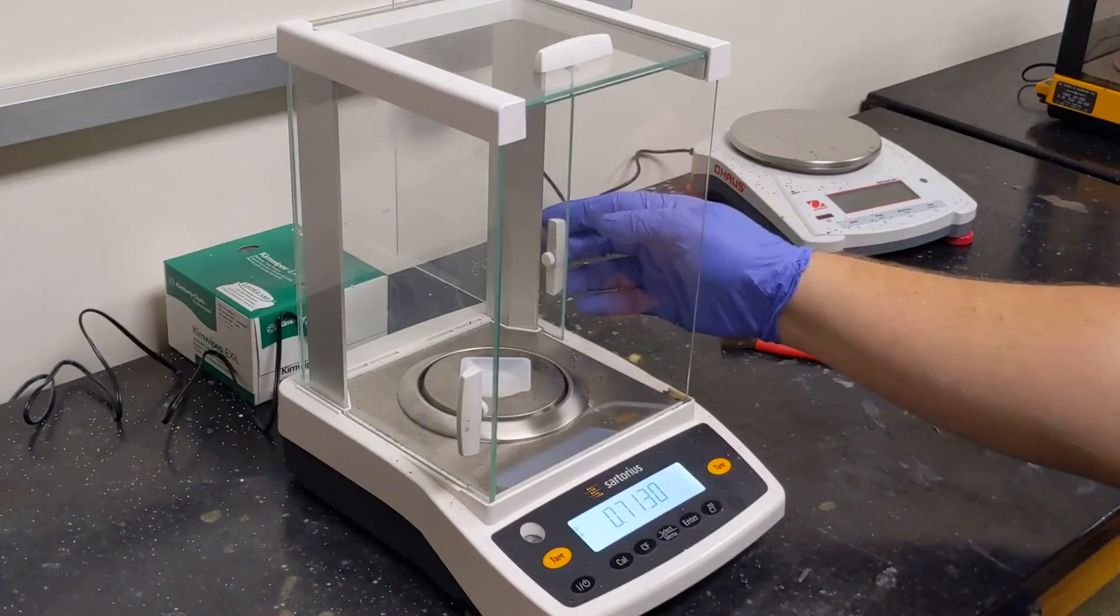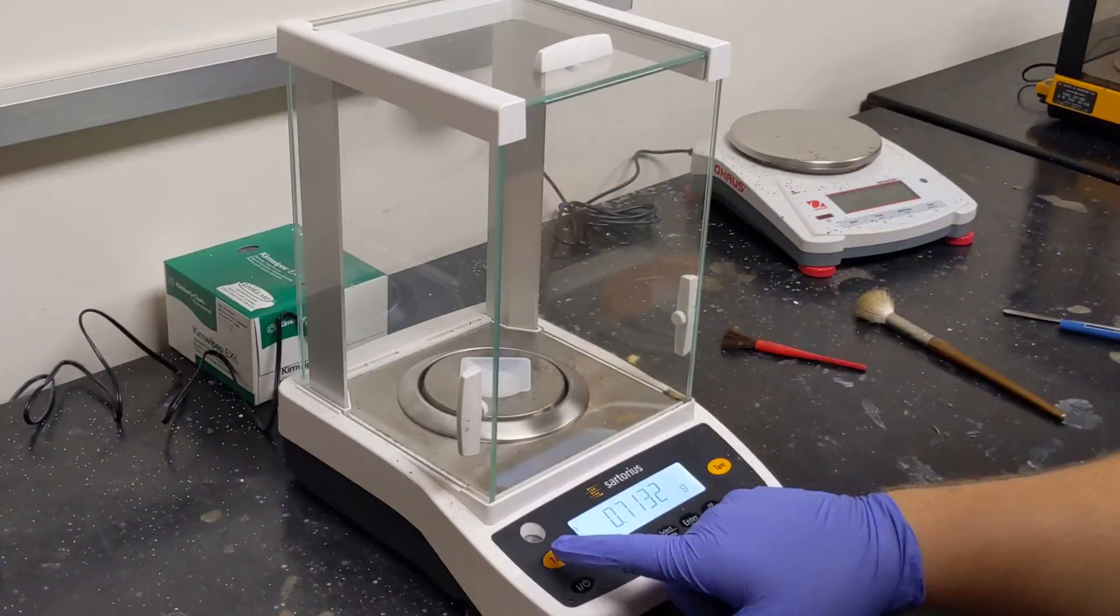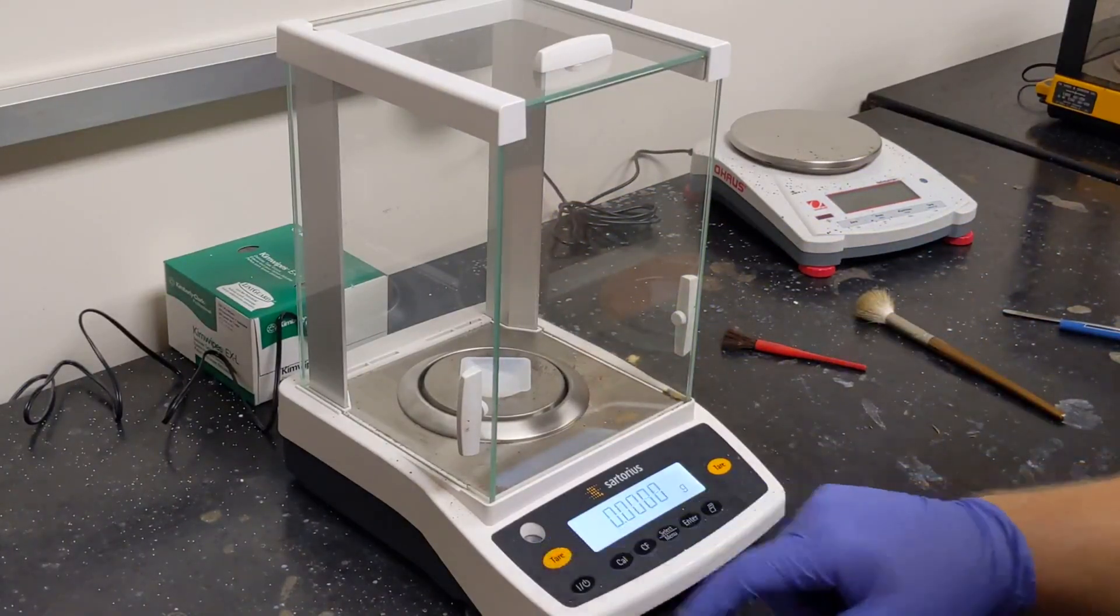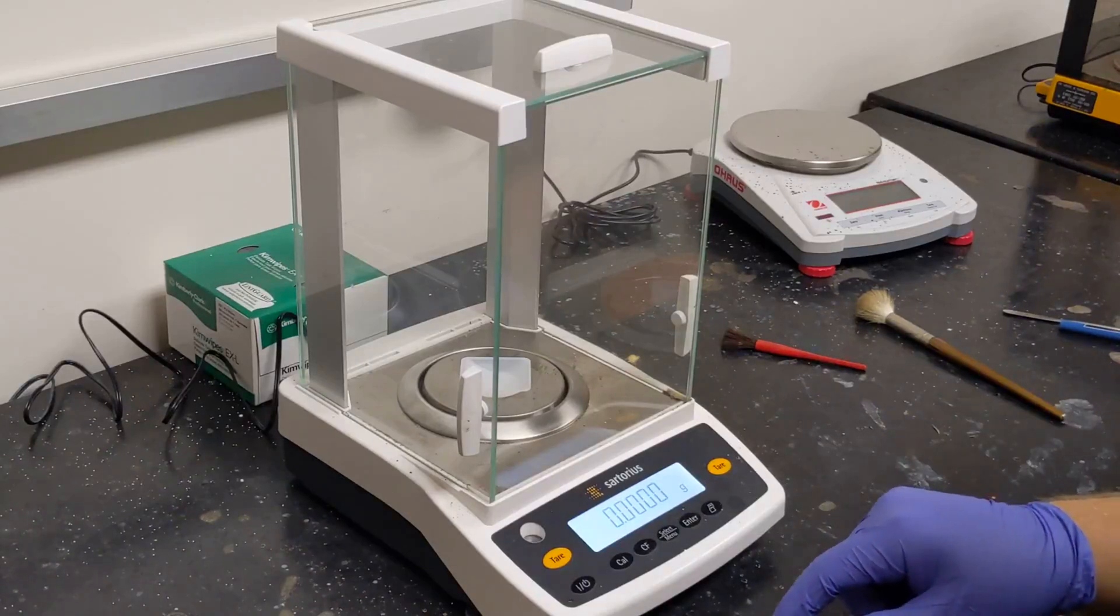Now we need to close the door to the balance and tare the balance. That's the large yellow button. When we press that, the mass for the balance will be zeroed out to account for our weighboat.